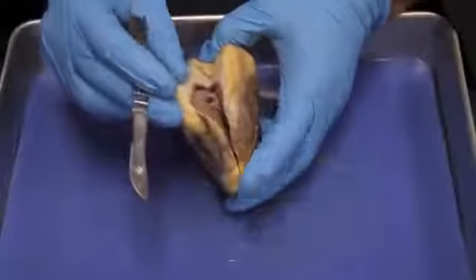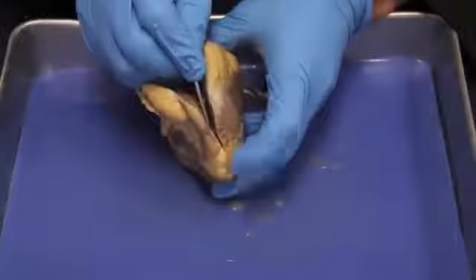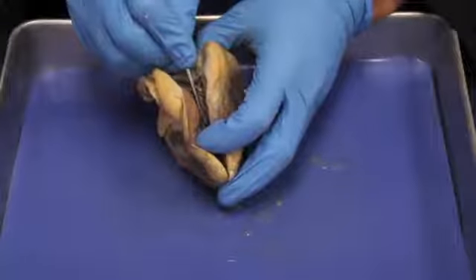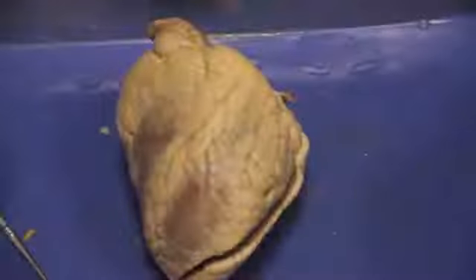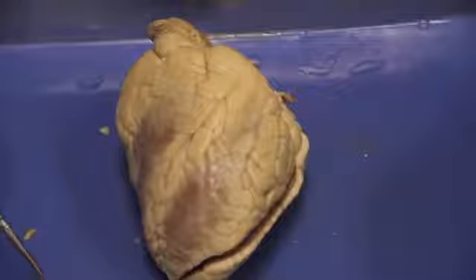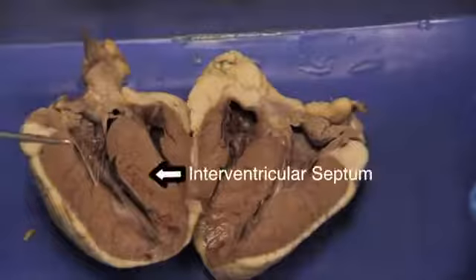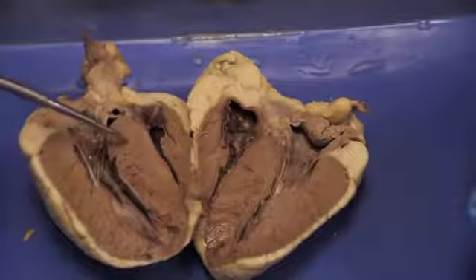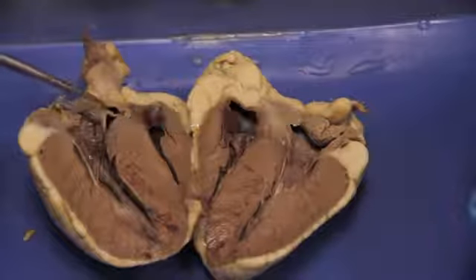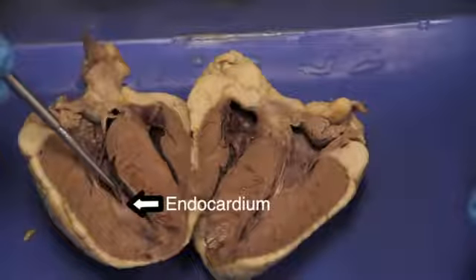Now open the incision you've made and cut the rest of the heart from the inside. This will split the heart into front and back halves. Looking at our frontal section, denoted by the anterior side, your group needs to locate the interventricular septa and the interatrial septum, the epicardium, the myocardium, and the endocardium.